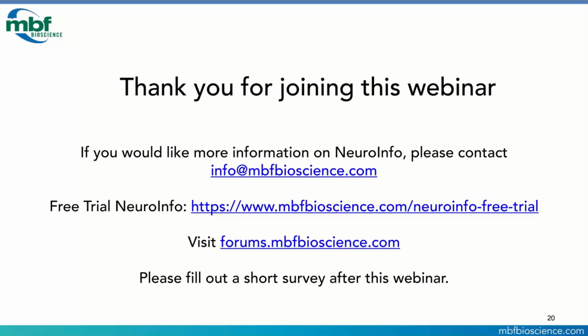One interesting question is what about other brain atlases? This was all on the Allen today, and so I've had a lot of questions about different species as well as different atlases like Paxinos and Franklin. And Chip, maybe we both can answer a little bit on this, but I'll let you go first.